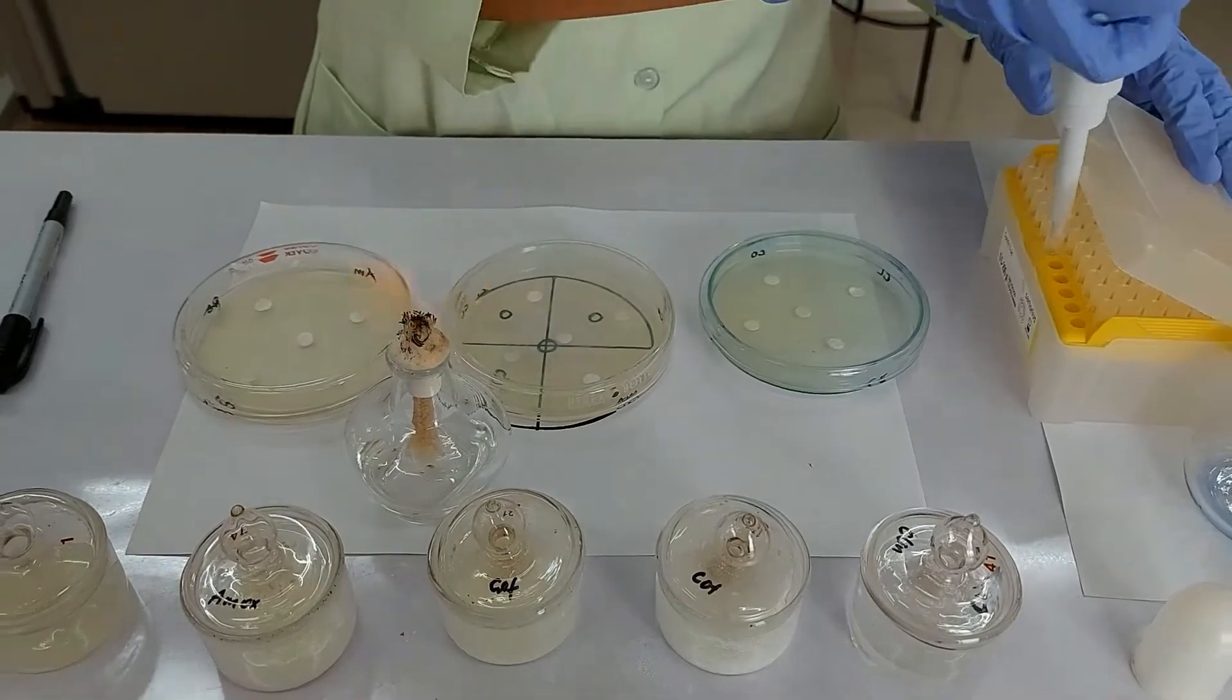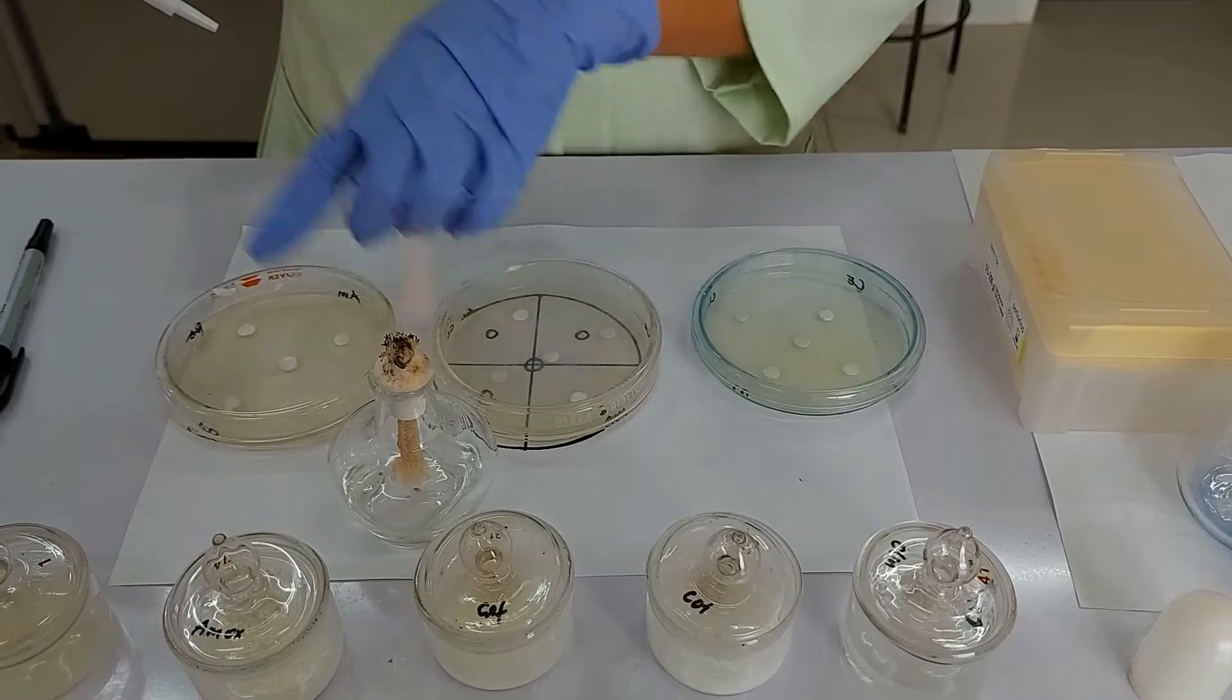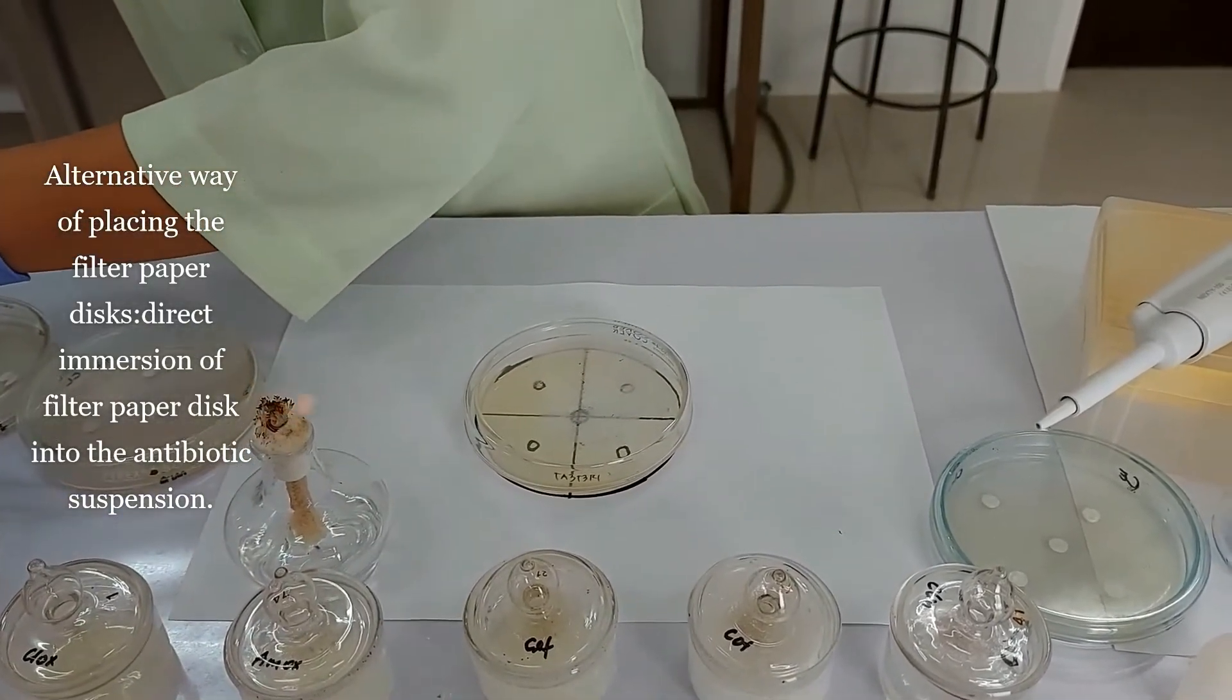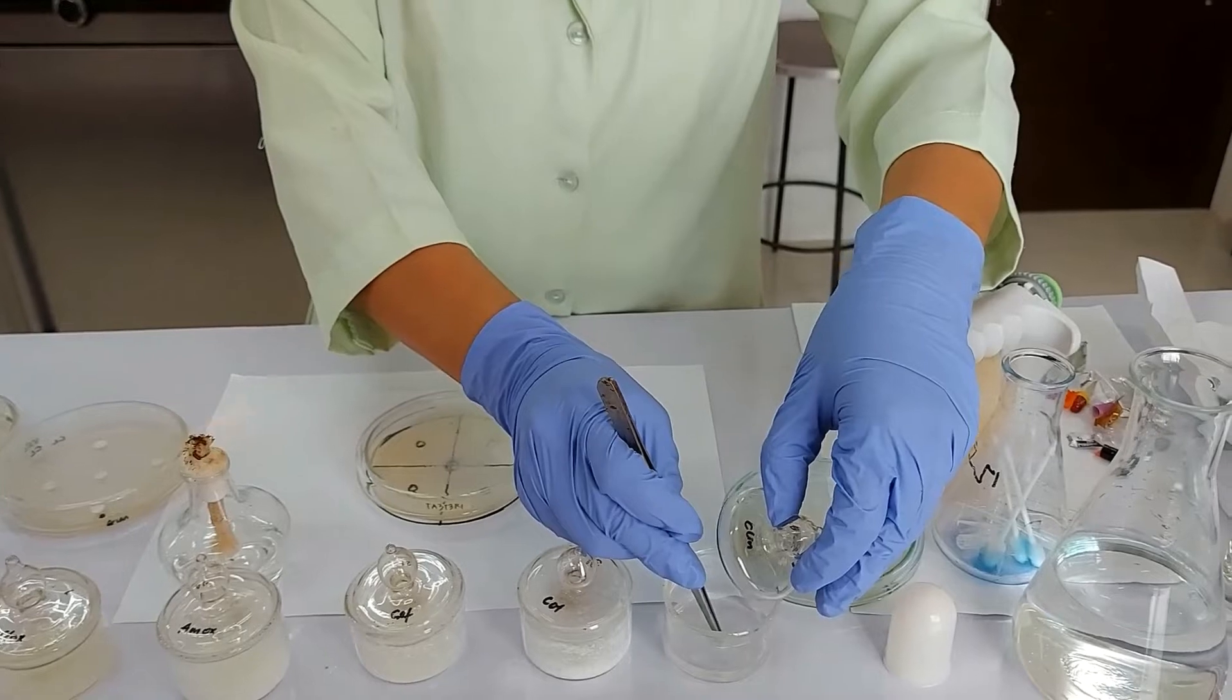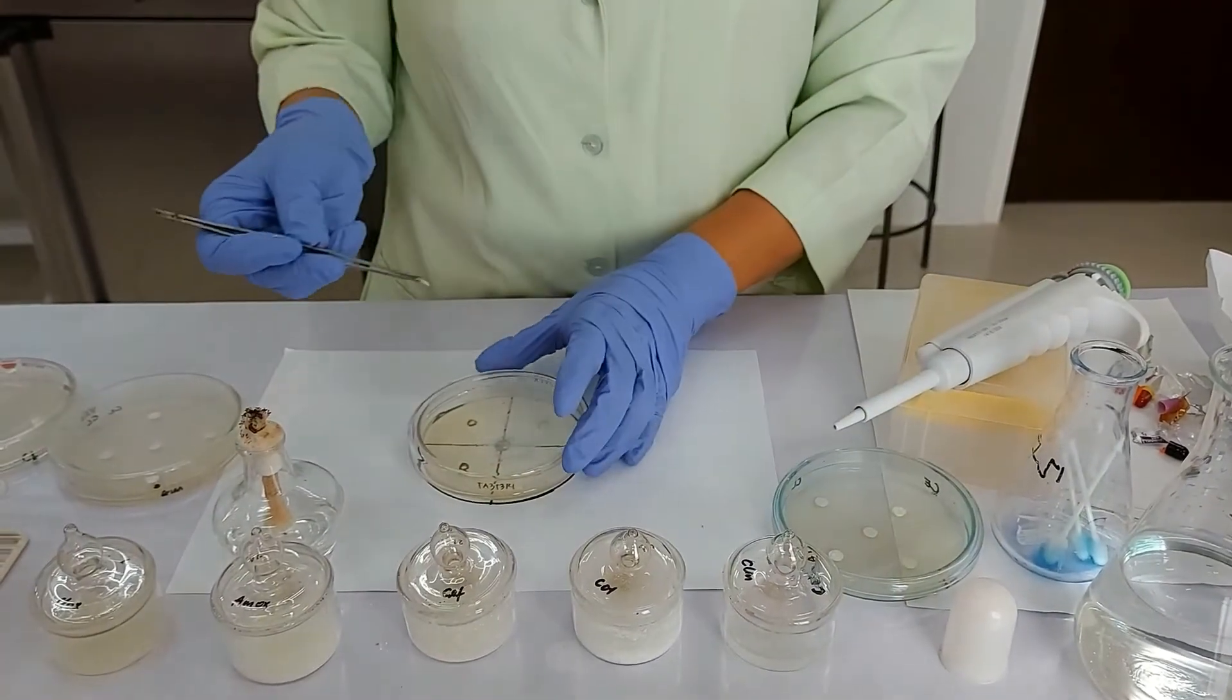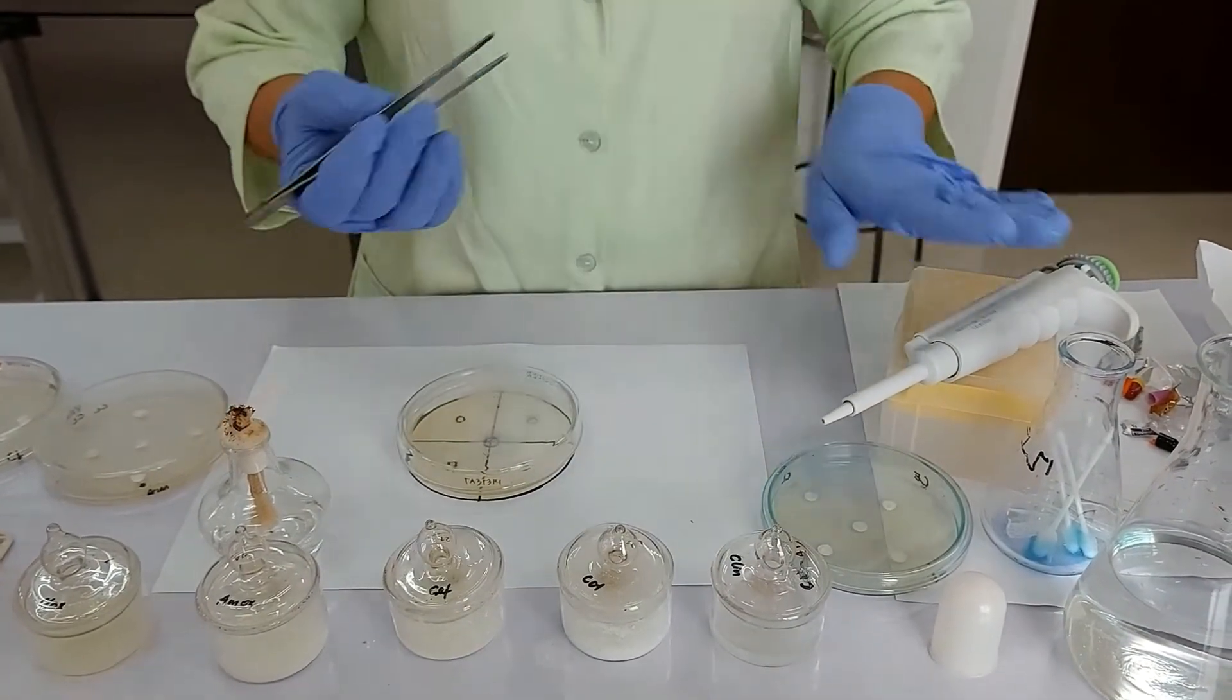We have to do this for all of the filter paper discs that we have in here. Another way by which we inoculate this is we just simply get a filter paper and then you immerse this directly in here. Make sure you drain the excess liquid by touching the side of your container, and then you can directly put it on the surface of the agar. Sometimes this is easier, especially if you don't have a micropipette.